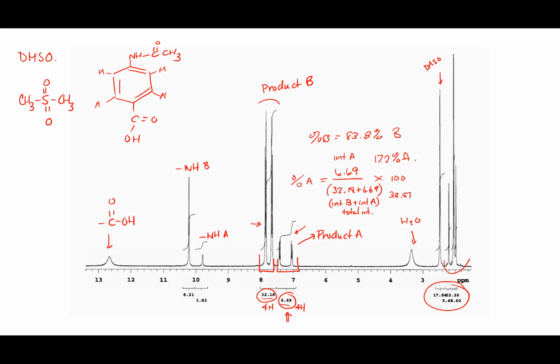But basically what we know is that product A was not completely converted, but it's about 80 to 83% pure, average about probably 81.5. So that wasn't bad, and that's very typical. So in your report, you're going to show the work on the spectrum that you get, and then include that in the results table, as well as in the discussion of the purity of the sample.